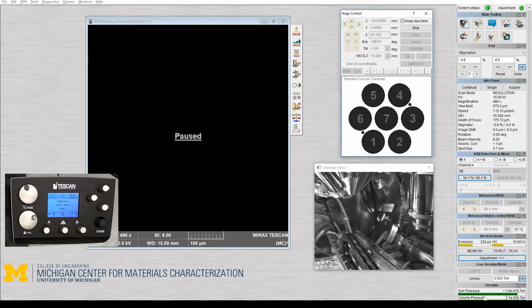So I know, for example, Alex, I trained you on the Mira. I don't know if we trained you on the Rise, but if not, then it's a very simple thing. So once you have FOM access, just book time. We will be here and can help if necessary.